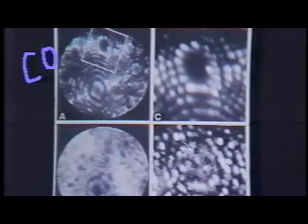And you might say to yourself, well, that seems like an involved process. Why is that any advantage? You can do this all by field ionization. The advantage is the CO comes off at a low field strength of the order of 1 volt per angstrom. Now you might say, gee, that's not very low, right? I mean, that's still 100 million volts per centimeter. It's pretty high. But in the field ion game, it's very low, and that has obvious advantages, as I'll show you. For example, here's a field ion micrograph image of a tungsten surface.